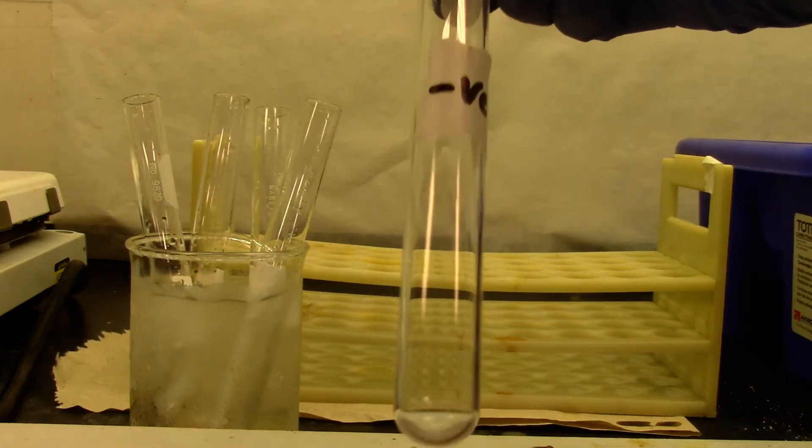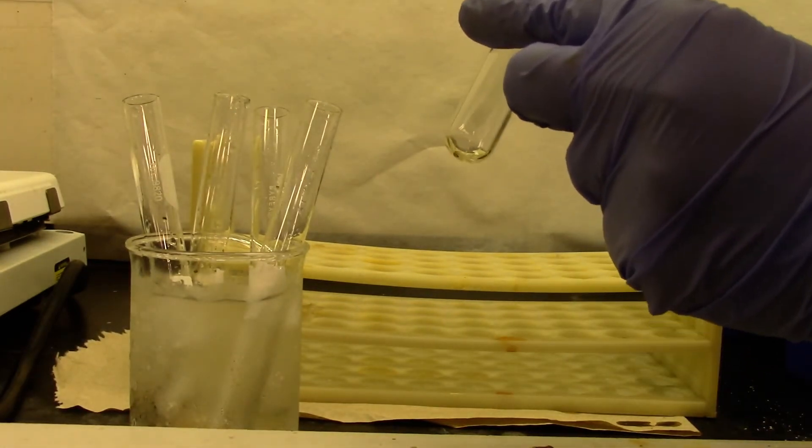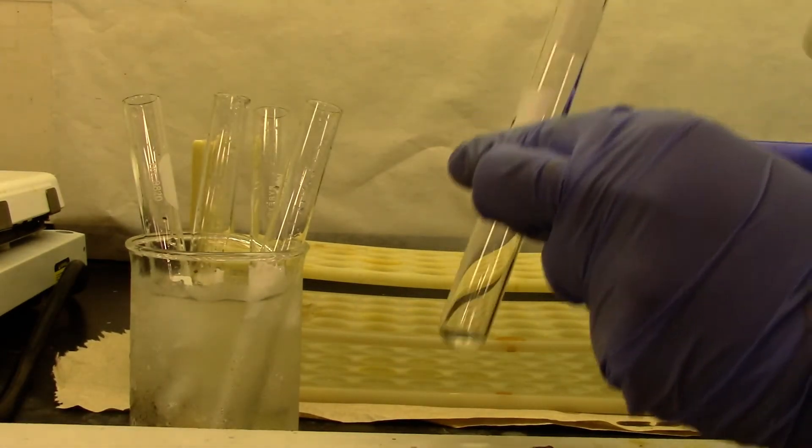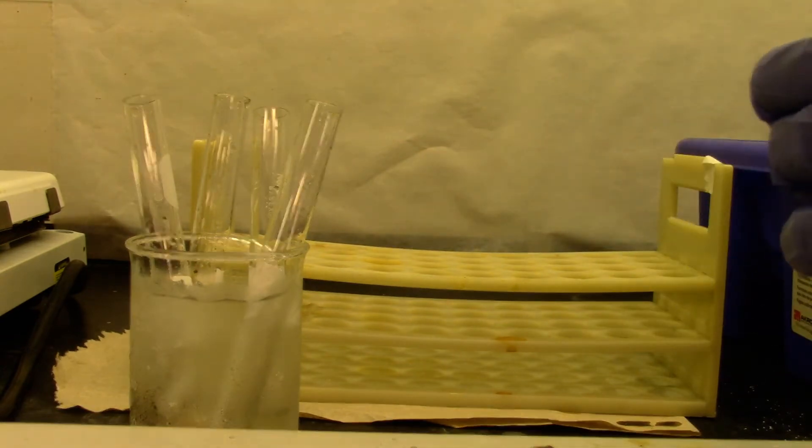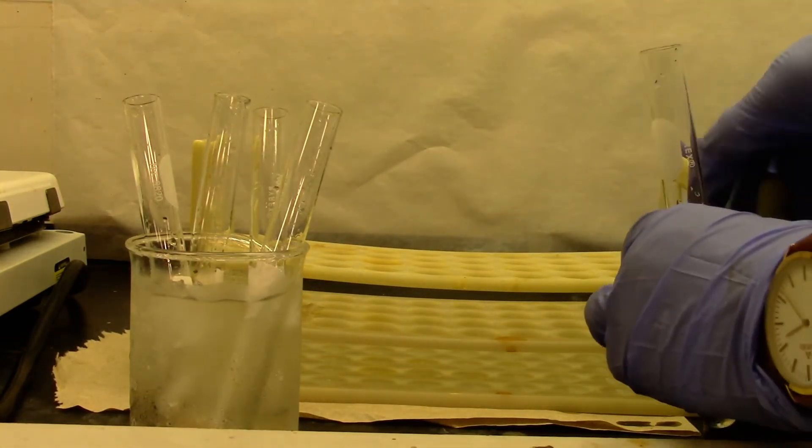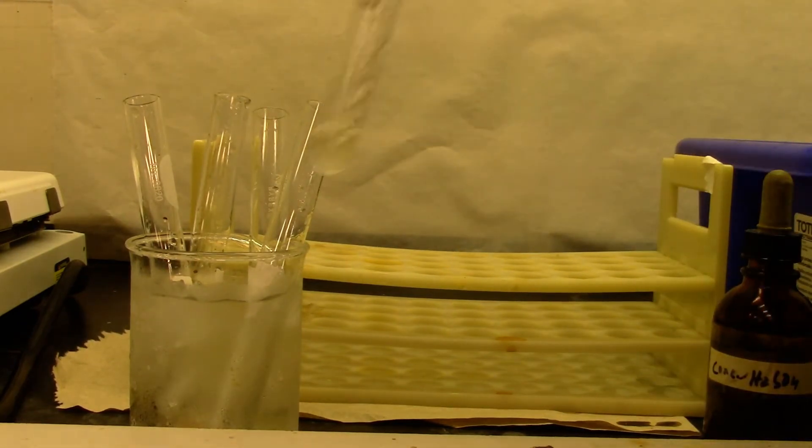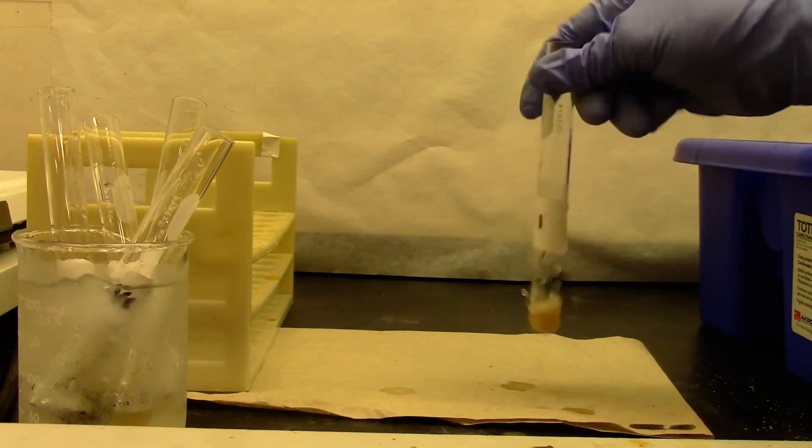For a negative test, I am going to use toluene, and then about 2 mL of water, and then 8 drops of sulfuric acid. I will place it in the ice bath as well.